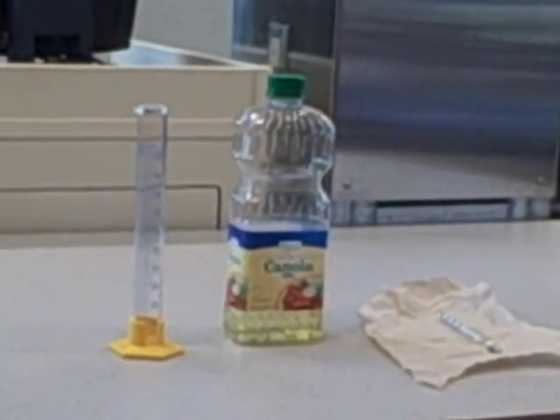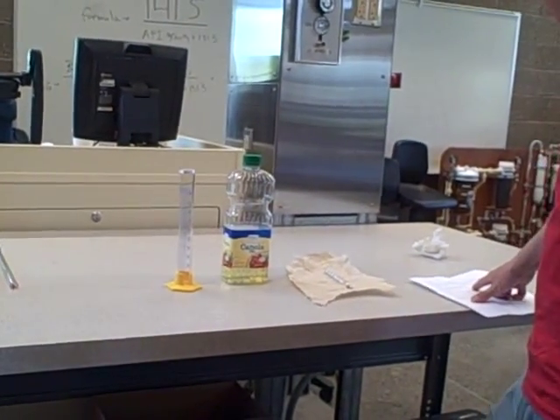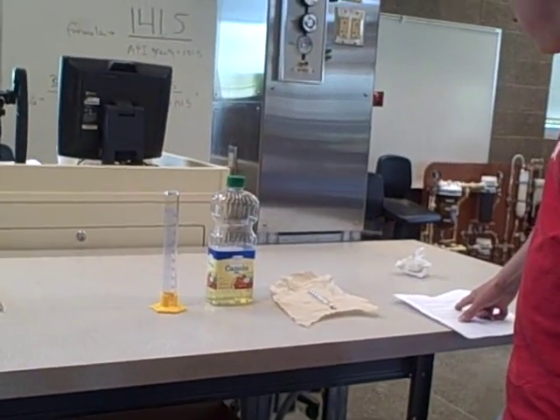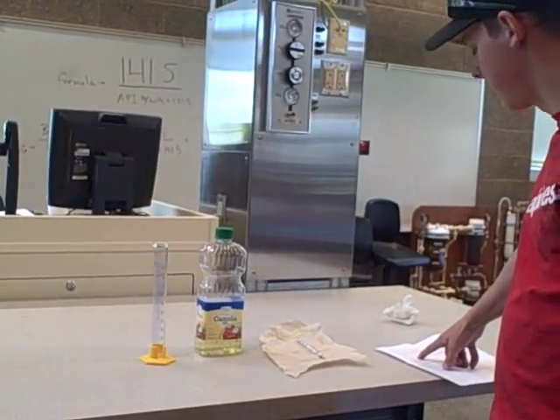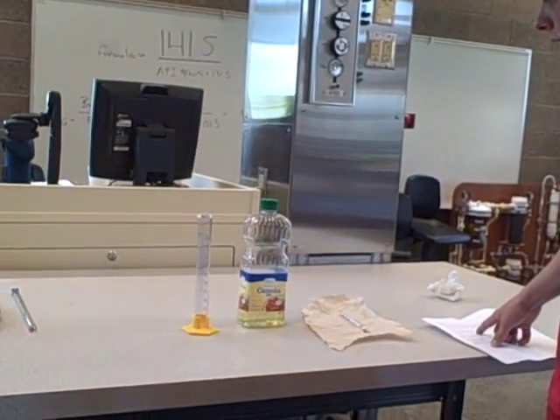API gravity is a measure of how heavy or light a liquid is compared to water. If its API gravity is greater than 10, it is lighter and floats on water. If it is less than 10, it is heavier and sinks.